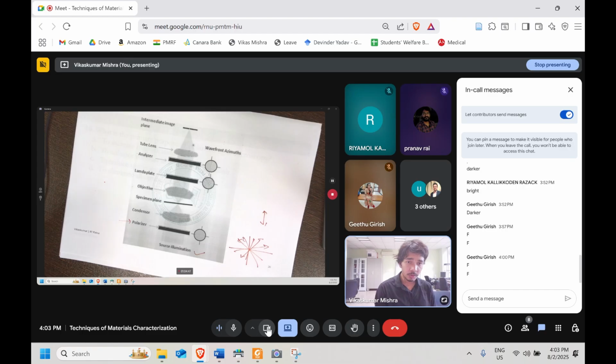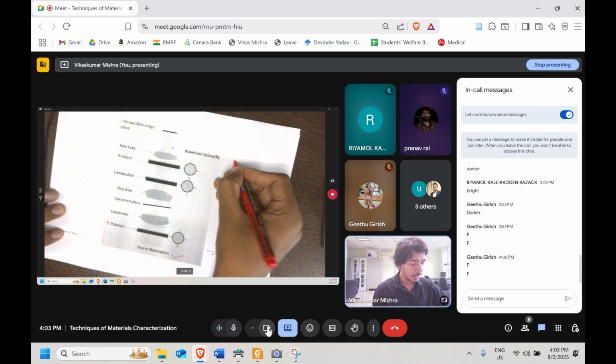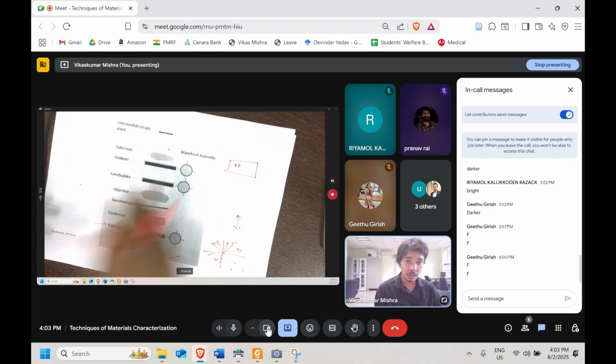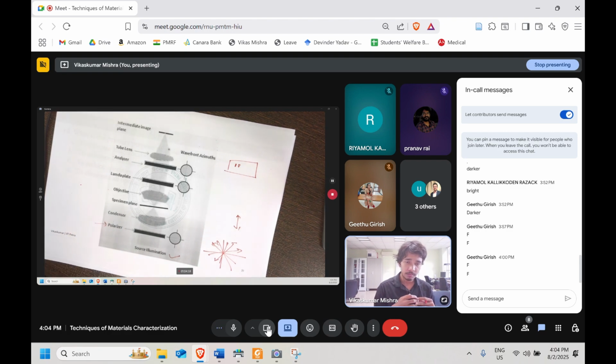Since it is following two different paths, we know that in our specimen different sections and regions will have different refractive index, and different contrast. Even if you consider a polycrystalline material of the same phase, with no multiple phases, different grain orientations are there. Each orientation will behave differently to the light, and their refractive index will change based upon the orientation. That orientation information you can extract.